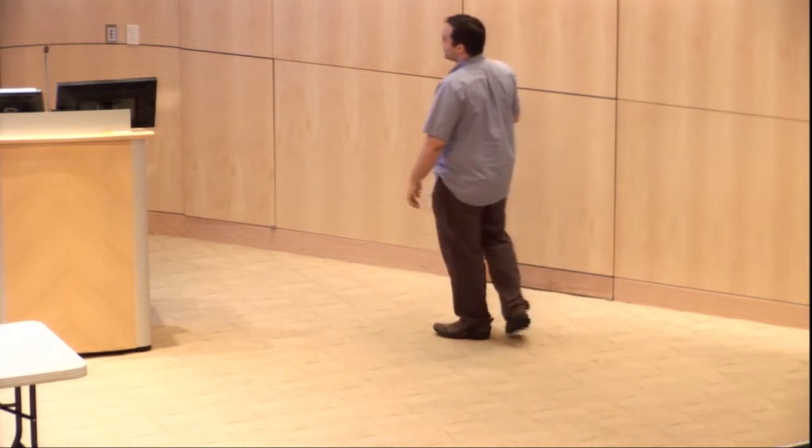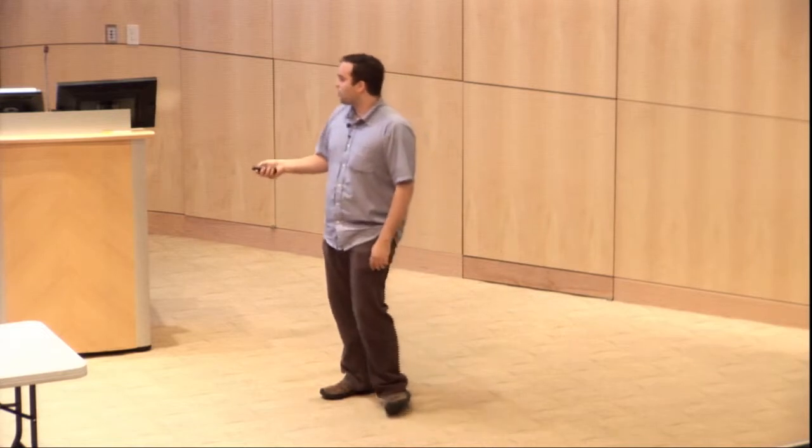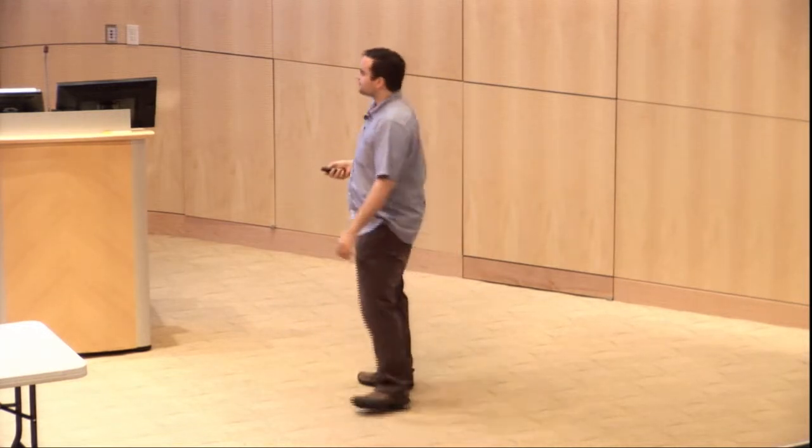Finally, there is statistical imputation. Now, this relies on having what's called an imputation panel, which can either be all of the data if you have a large study, or your data plus some other panel. So for instance, if you sequence 60 individuals from Europe and you want to know the phasing, you can take them plus 1,000 Genomes, the European samples, plug them through our pipeline here to call into an imputation software, and then that will give you the phasing on not just your samples, but also the 1,000 Genomes samples, and then you can subset just to yours.